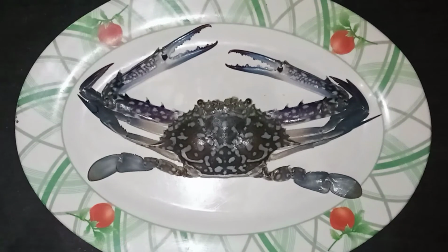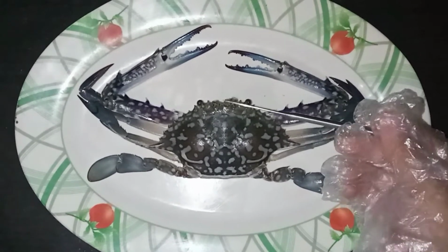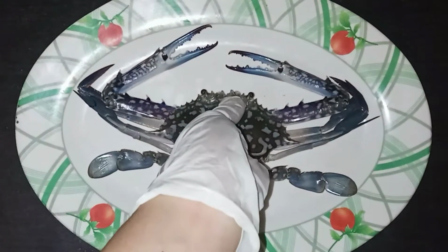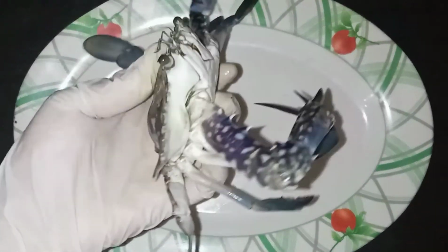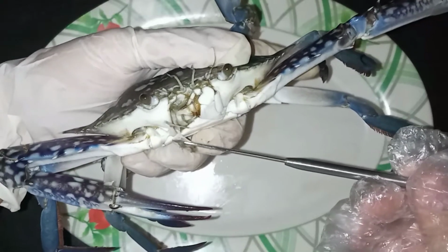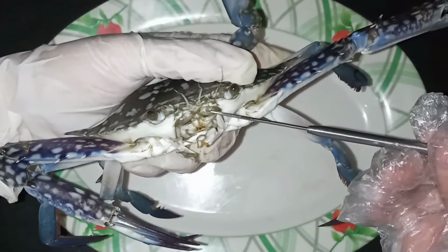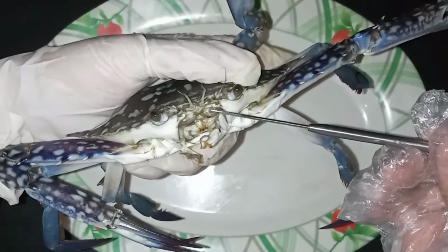Just like the other animals or species, blue crabs also have an anterior side and a posterior side. Here in the anterior side, we can see the mouth of the crab that contains the jaws that hold and push the food into its esophagus. It is located between the antennae.